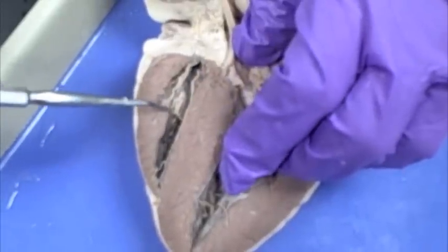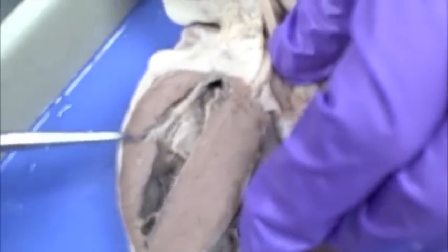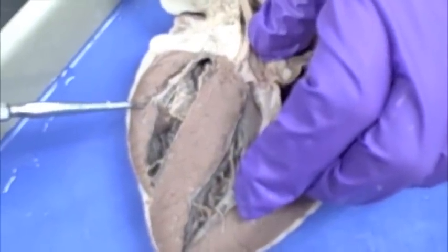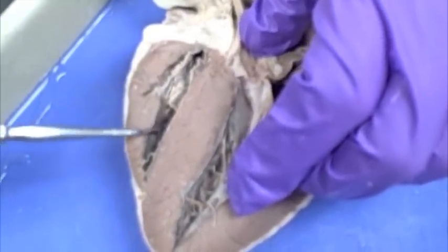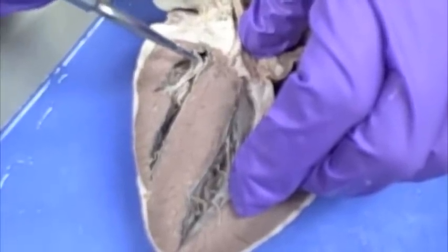See this lump here on the side of the wall? See how it comes in here and over right there? That right there is a lump and that's a papillary muscle. It's going to ensure that the chordae tendineae hold on to the valves so when the blood is going back up to the atrium, the valve is going to close.